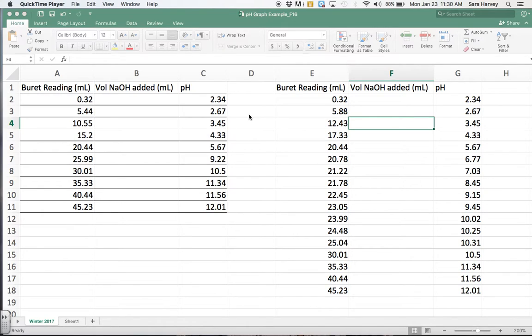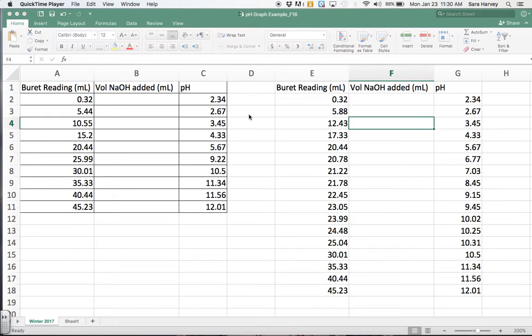Okay, in this video I'm going to show you how to convert your raw data from your two pH graphs and convert that into data that you will then plot on Excel. I want you to plot both data sets on one graph.